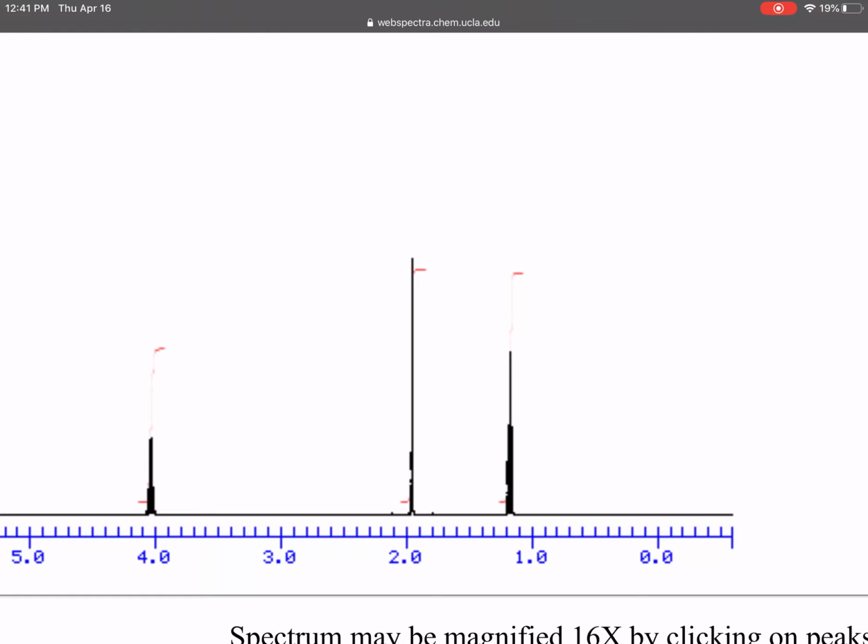All right, and I can see for signal A, obviously, it's going to be the one that has the smallest S curve. So I'm just going to make that one a baseline of 1. I'm going to say A equals 1. All right. If I move to signal B, the one in the middle, it looks to me to be about 1.5 times the size of the S curve for signal A. All right, so I'm going to make that 1.5. Signal C is about the same size as signal B, so I'm going to make that one 1.5 as well. Again, you can get more exact measurements if you use a ruler.